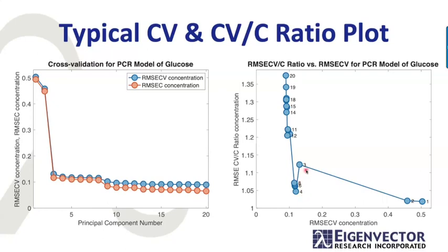And especially things get a bit better when I went from 3 to 4. I got a little lower cross validation error, and actually my overfit is better with this one. That's what this is measuring here. This vertical distance is how overfit my model is, and that is how much tighter the model fits the data versus its ability to predict it.